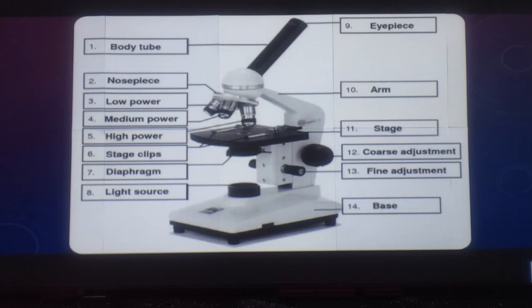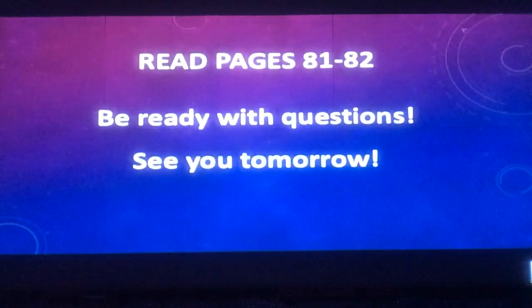Now, you'll need to know all of these parts of the microscope, so please study this. You'll have a picture of this in your book, and also a picture of this kind of microscope in your activity manual. Okay, please read pages 81 to 82 and be ready with questions tomorrow, and I'll see you then.